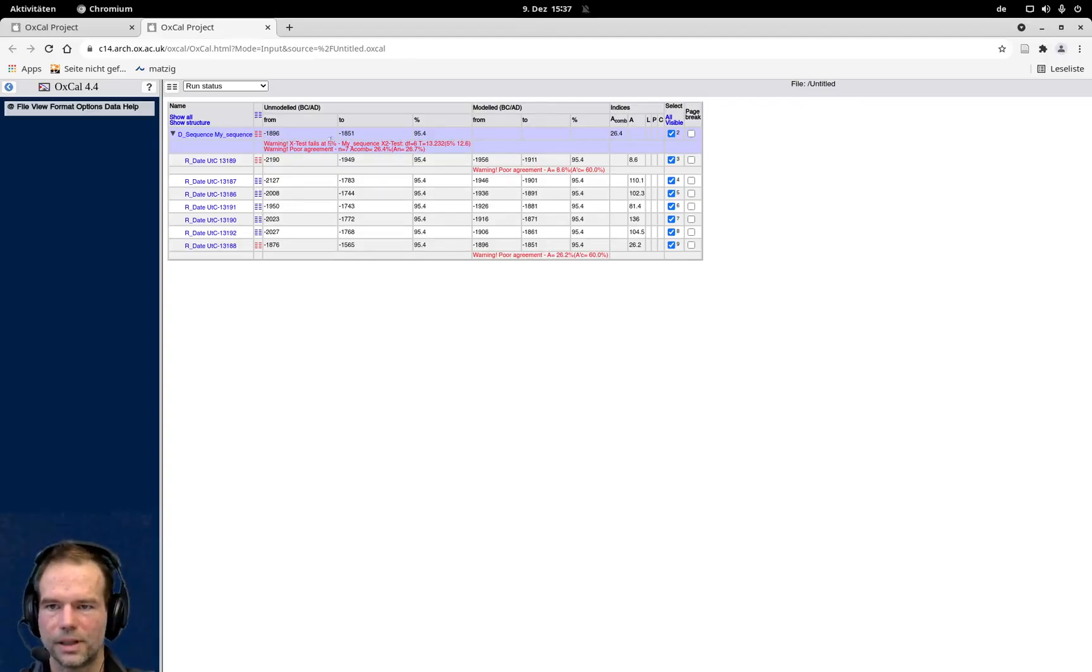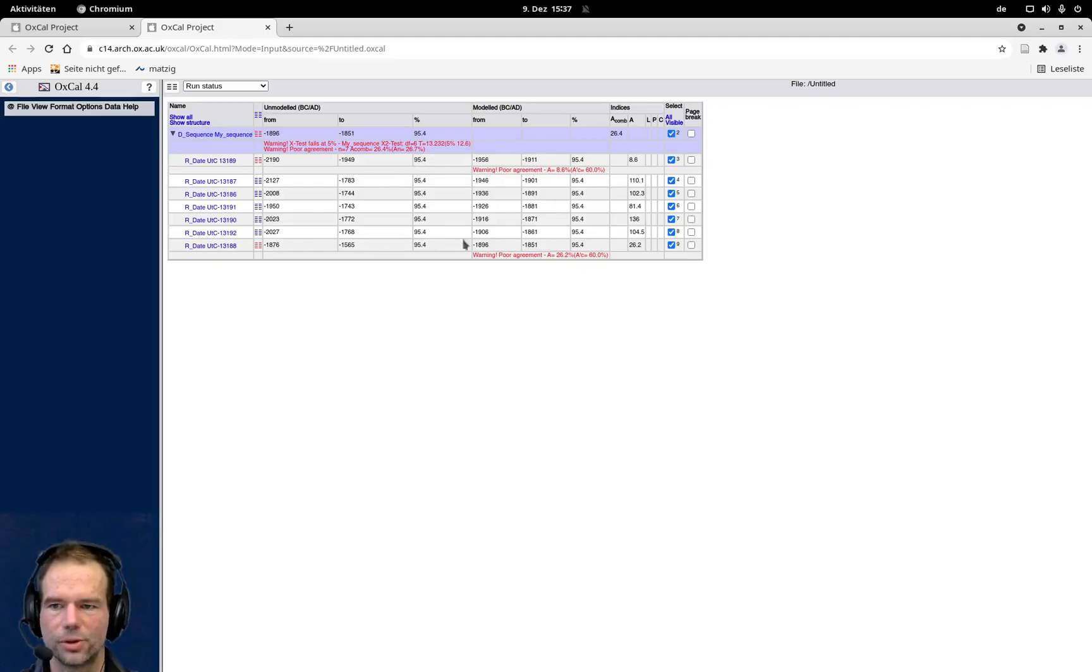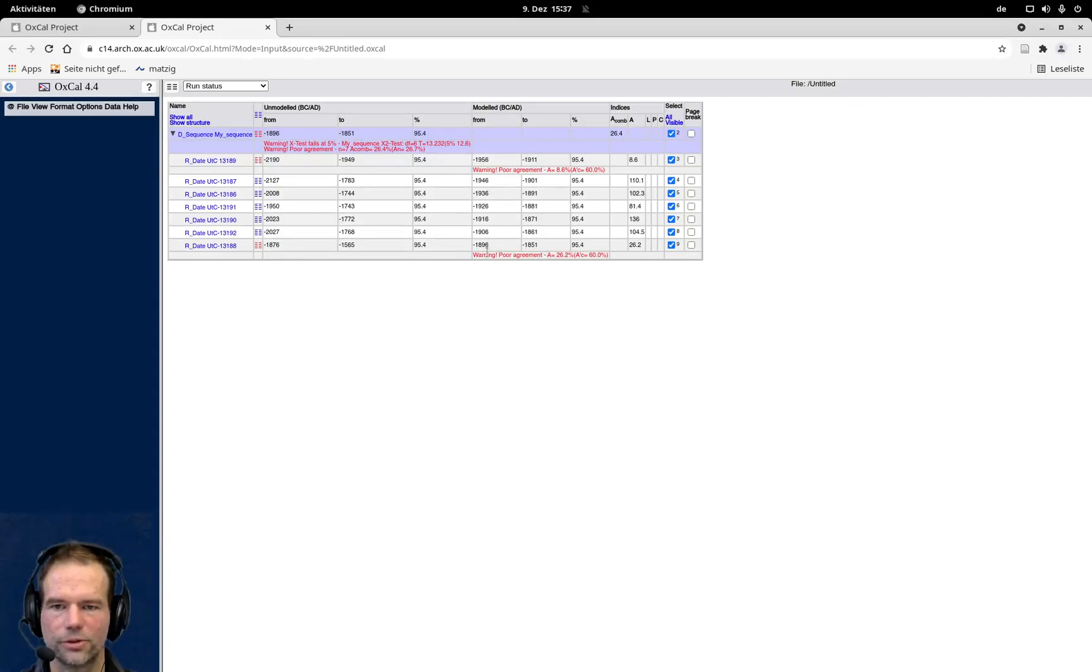We have here a poor agreement, which means this date here, it's very hard to really put that into this sequence here. Also for the last date, it's very far away from all the other dates. So there's a little chance that this is actually really in this 10-year sequence.